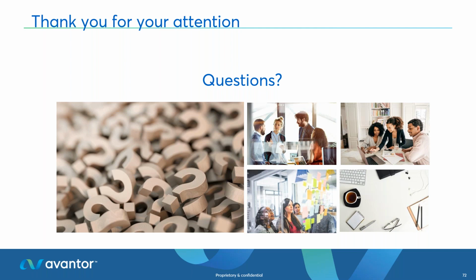But I think the best thing to do is to assess the consumables that are being used, and other ways like the liner, syringes, things like that. If you're seeing issues, look at ways to purge and clear out any residuals that may be causing issues post-injection, and think about the sample introduction technique and if it's efficient enough. Is there a way to improve it?